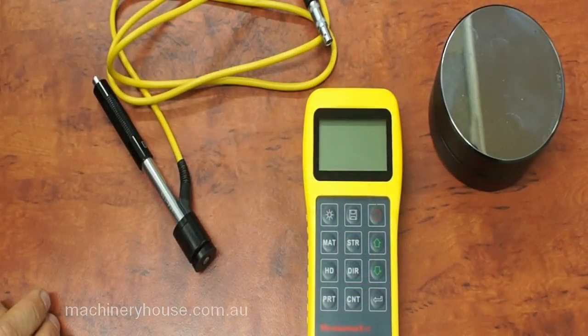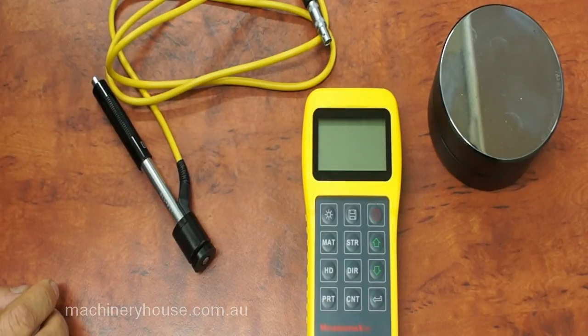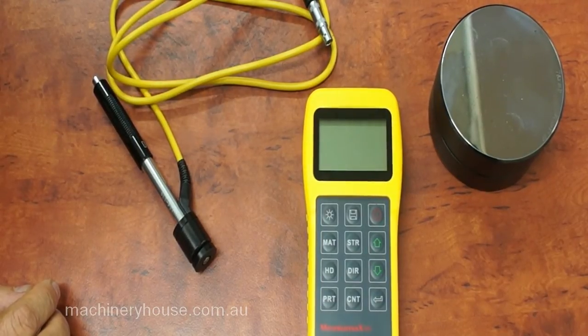I will now show you a quick operation of the portable hardness tester. To begin, insert the plug of the impact device into the correct socket on the tester.